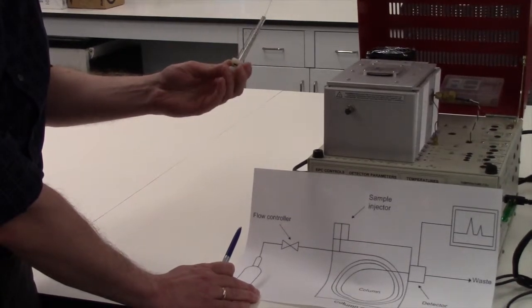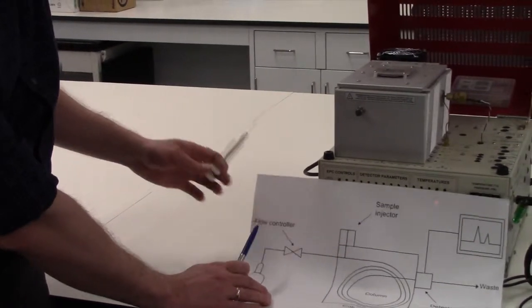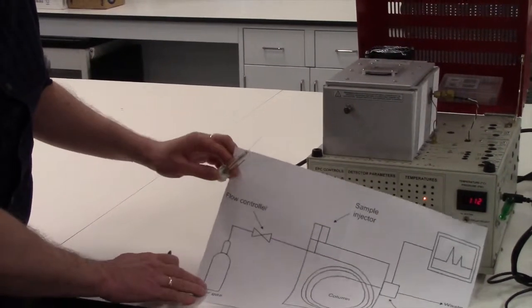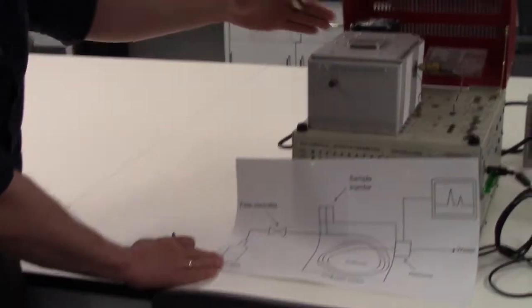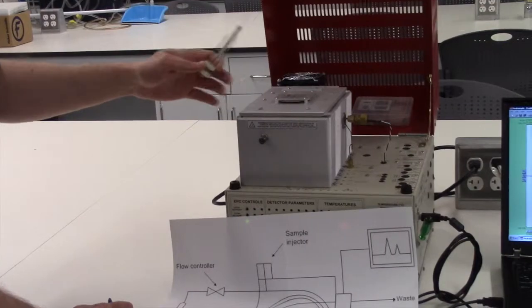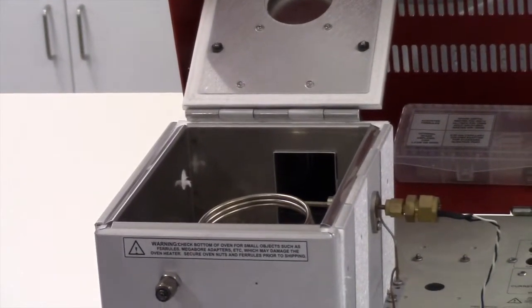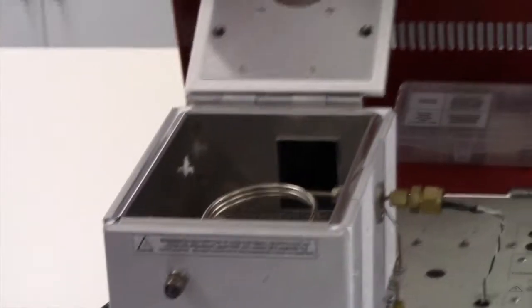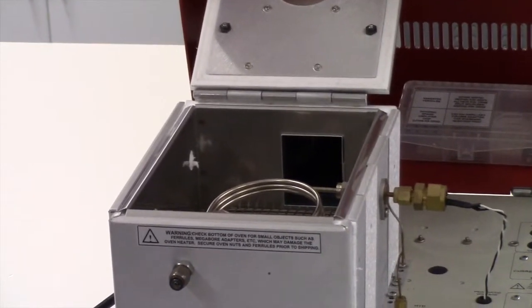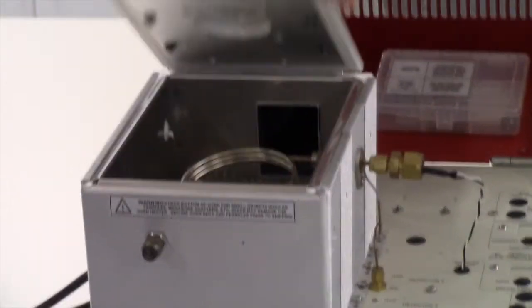In this particular case, we have a 10 microliter injection syringe. Next, we have the column oven, which of course contains the column, a packed column, and in our case it's a HayeSep D column of 3 feet length, and of course the heater inside.